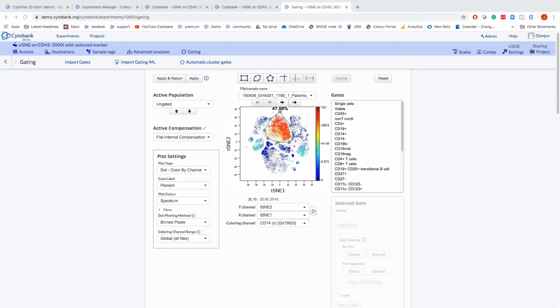Okay, so another very good question, and we did cover this in a way, but I'm just going to get you to reiterate. How do we decide what seed to assign if we're looking for consistent results? So the seed actually is a random value. We do not recommend assigning the seed for a particular run. In general, we just let the viSNE algorithm generate a random value.